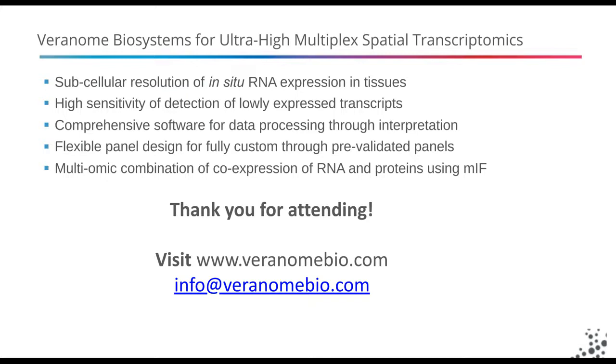And so we've developed a number of different sample prep protocols and techniques. For some particular tissues, clearing is not required. For other tissue sources, we have been working on implementation of such methods. It really comes down to characterizing and providing our customers with a decision tree to help them understand which path they want to follow.